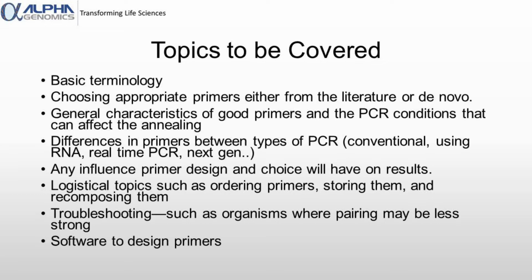on the results or success of the PCR reaction, some logistics topics such as ordering primers from different companies, storing the primers and resuspending the primers, troubleshooting such as organisms where pairing may be less strong, and software to design the primers. And at the end we will try to use some software for primer designing as well.